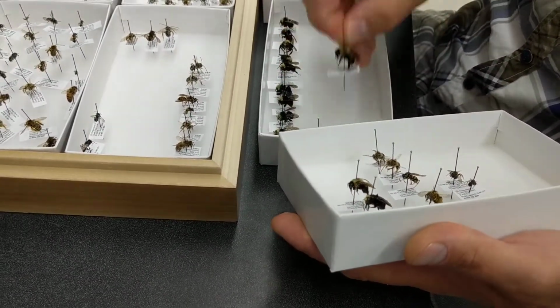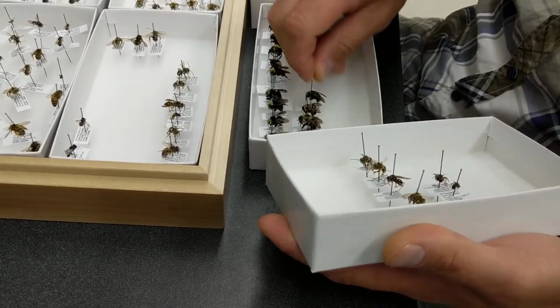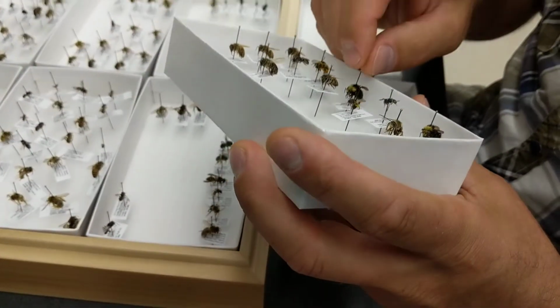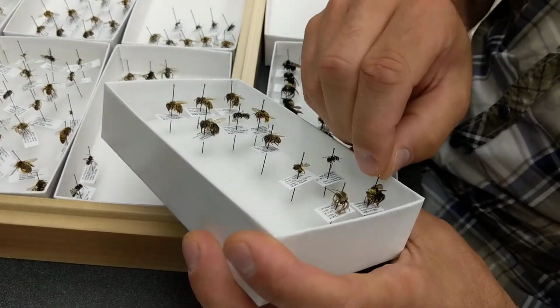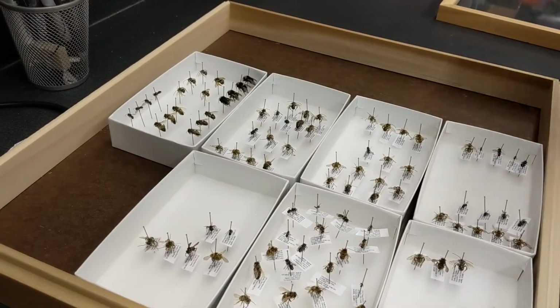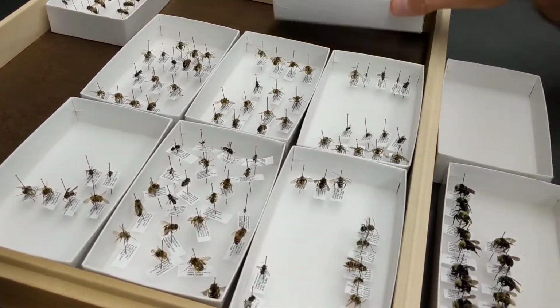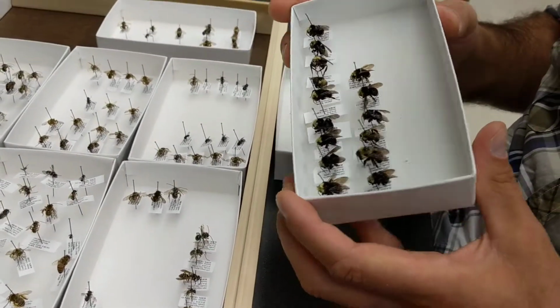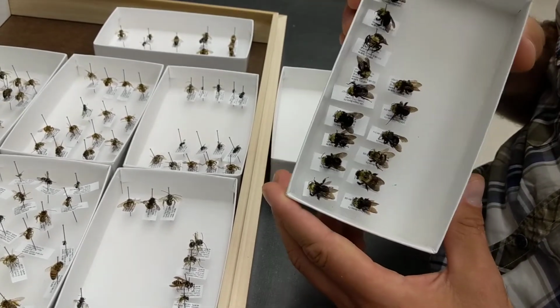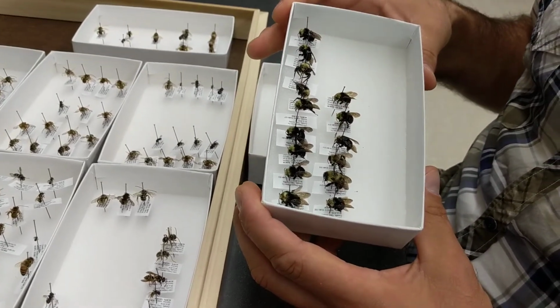And then you can start to see as you pull the bumblebees out that maybe there's a few different species here. If you really know your bumblebees, you'll probably know what species they are on the wing. So, is that all the bumblebees? We're not going to do these ones because they don't have labels. And so that is all the bumblebees. We'll just take a look at these for a moment. I think just to emphasize, it is important before you do this step, you're going to have your labels on them. So don't do this before you have your labels on.